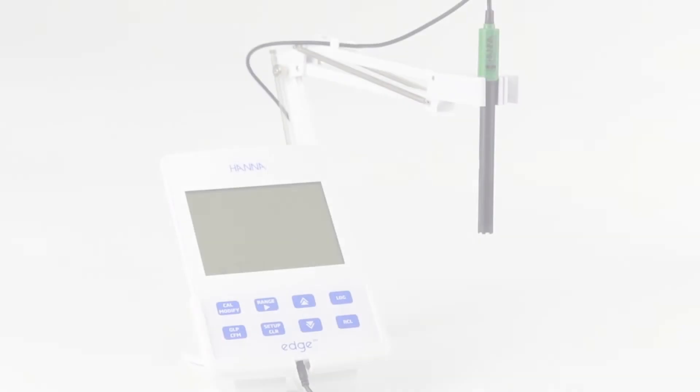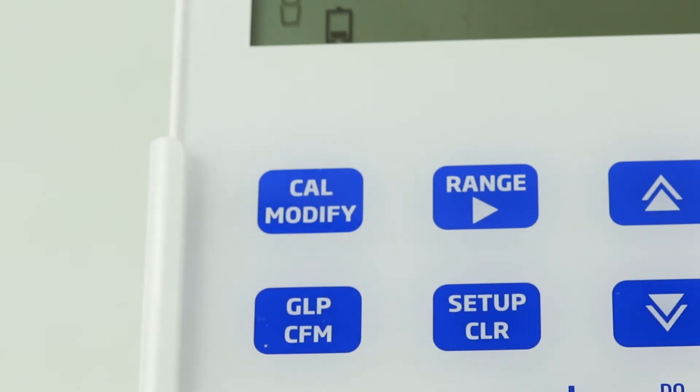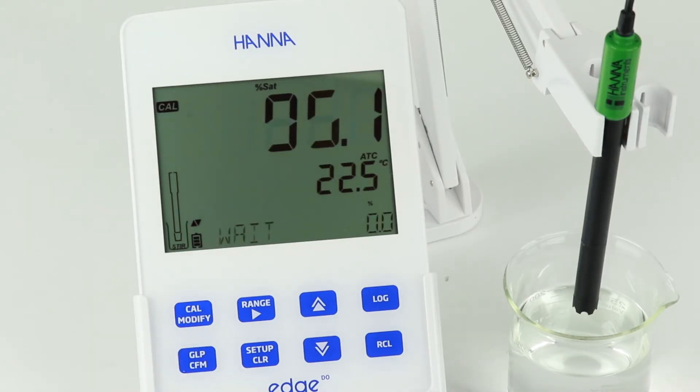To calibrate at 100%, prepare a beaker filled with water. Press Cal and hold the probe just over the beaker with water — make sure you don't submerge the probe. Once the reading is stable, press Confirm to accept the calibration point. Edge is now calibrated to 1 point.